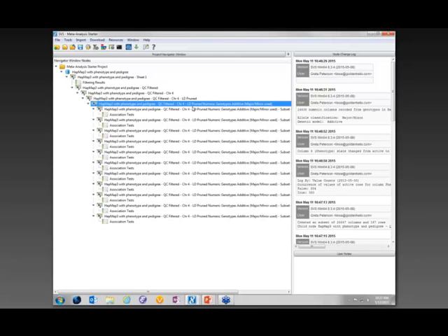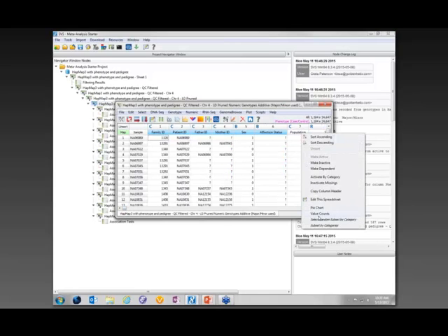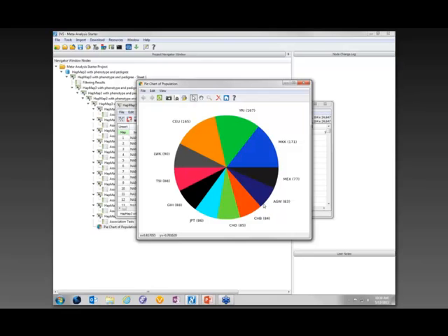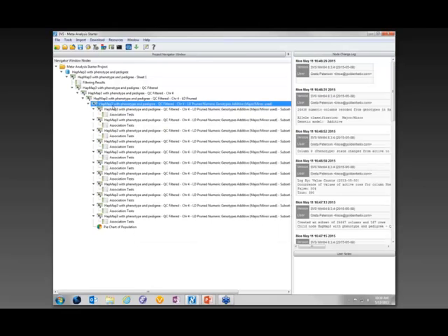And then after that, I split this particular data set on population. So here, if we look at all the population, look at the pie chart, we've got numerous populations here, 11 populations. So I split that into 11 spreadsheets and ran an association test on each of these. And we'll do a meta-analysis to combine all of these results to see if there are any markers or loci that trend the same way across all the populations.